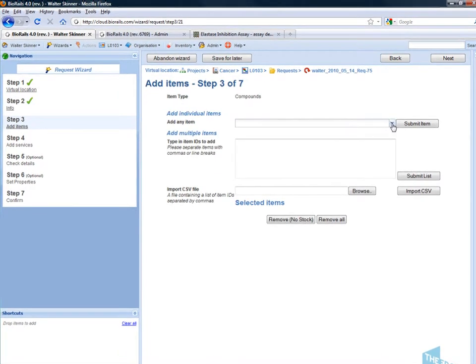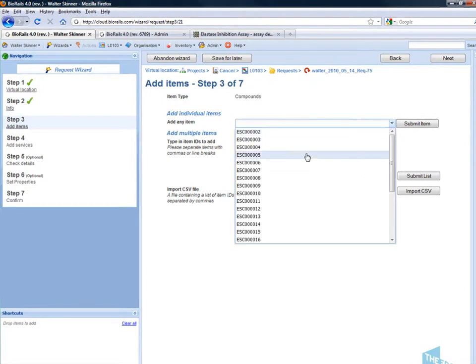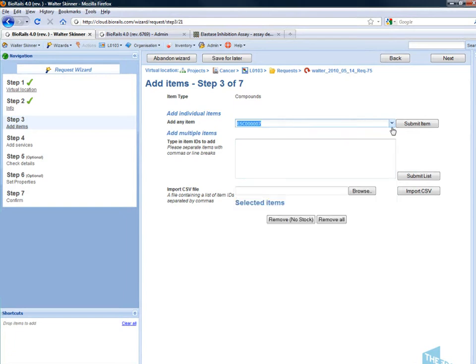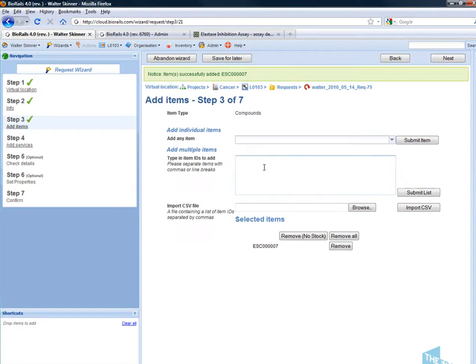Now I can select my items to be tested. In this case the compounds are being directly looked up from the compound registration system in the organization. I can also put in a list of items.